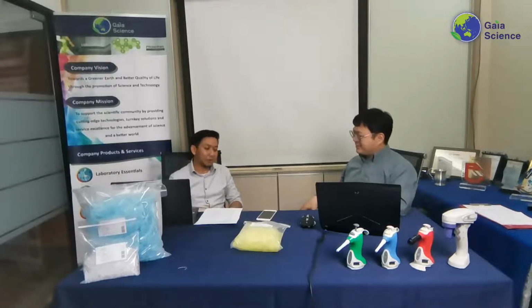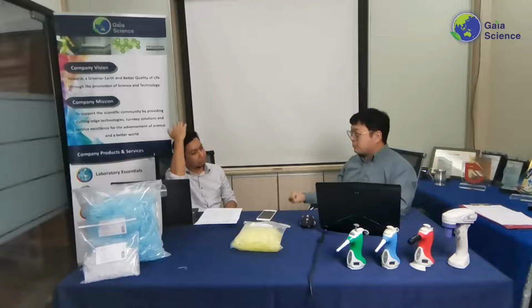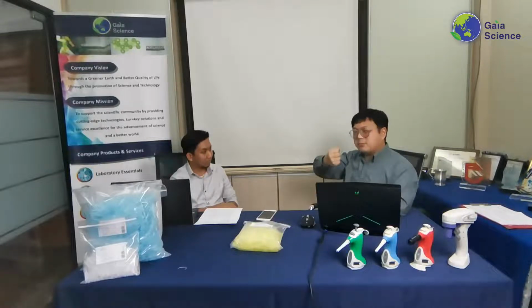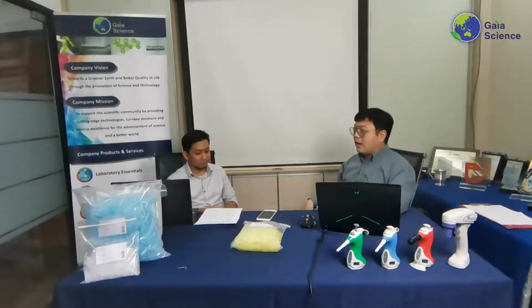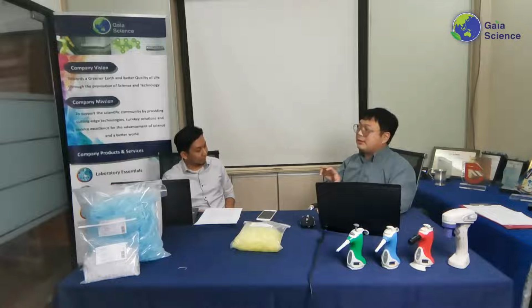But the golden tip is that as long as you get your sample, you try it first, validate by yourself, and only then you proceed with that one. That's actually true. One of the things I would advise, and I think I've told you before as well, is that although they might be universal, it's best to fit it, test it, and see whether it fits your needs. The best way to know that it doesn't fit is that when you put it in, no matter how hard you push, it still comes loose. Then you know it's not a perfect fit. If it doesn't fit into the rack to autoclave, definitely those universal tips are not suitable as well.